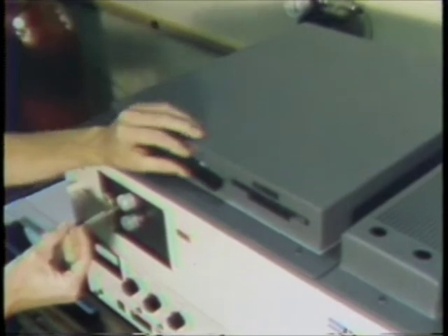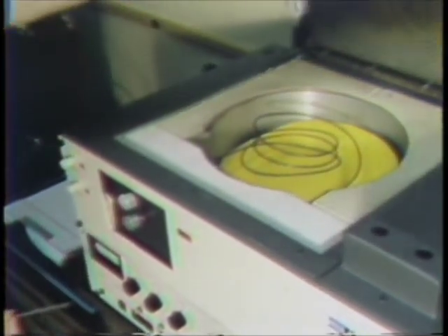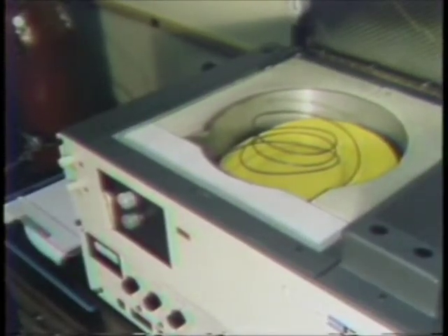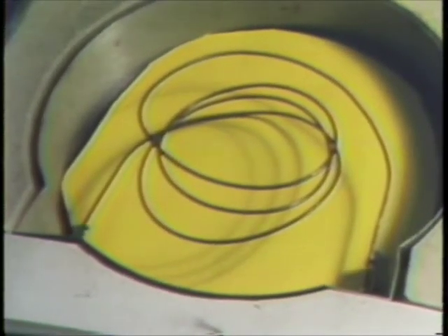The vapors are swept into a long tube by an inert carrier gas such as helium. The tube is surrounded by an oven to keep the sample in the gaseous form and is packed with a solid material to which substances A, B, and C adhere with varying degrees of affinity.